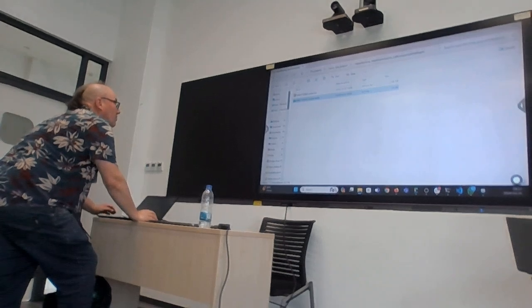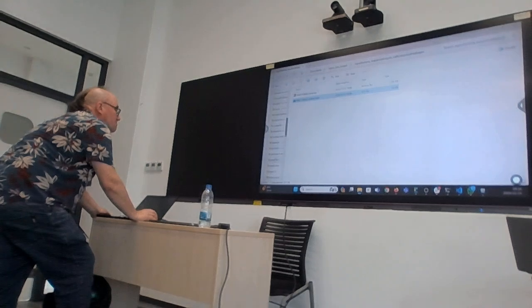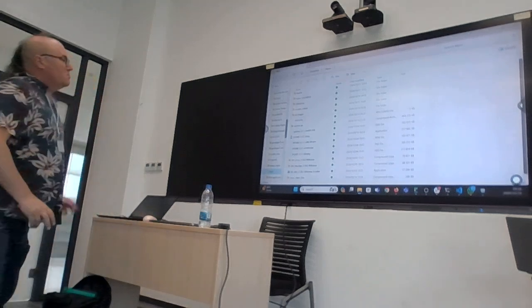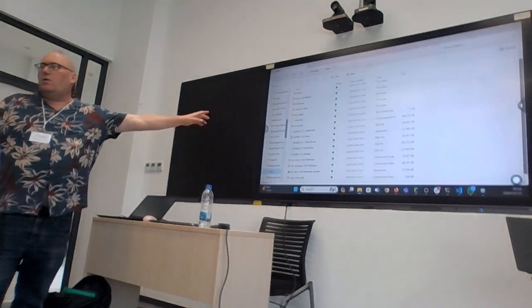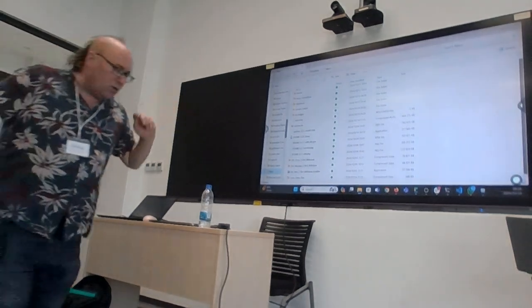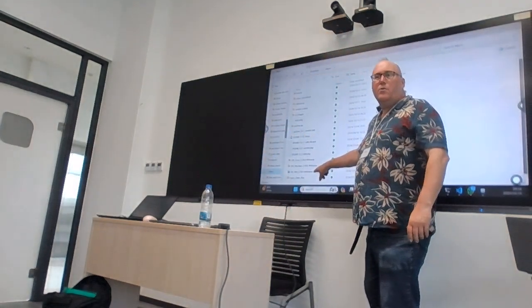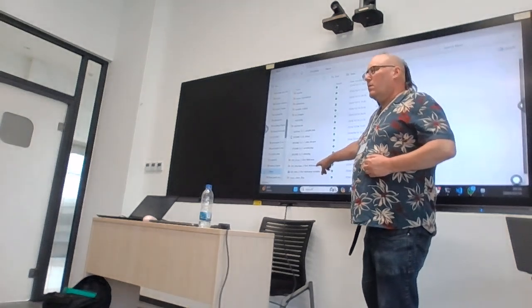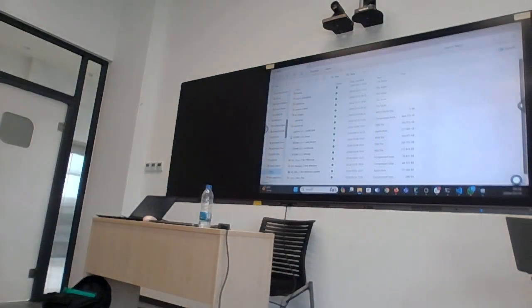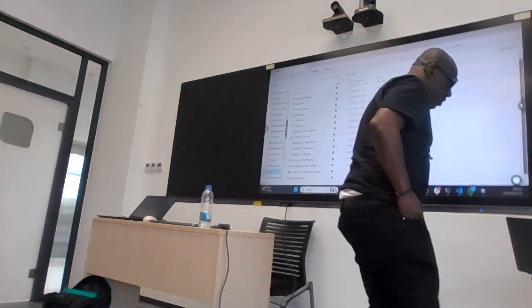Dropbox. Where's my copy of the stuff? The folder that you unpacked, you've got IGV already there, so you can install IGV from your computer. Just click to install. If you look at your directories, okay, now I think I've confused almost everybody. That's fine.